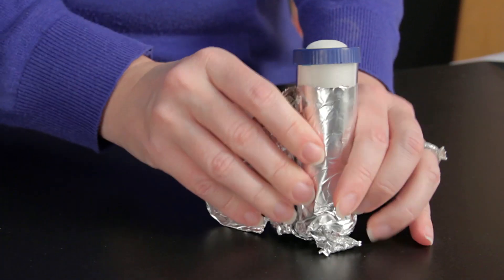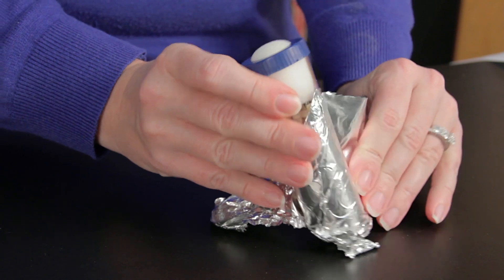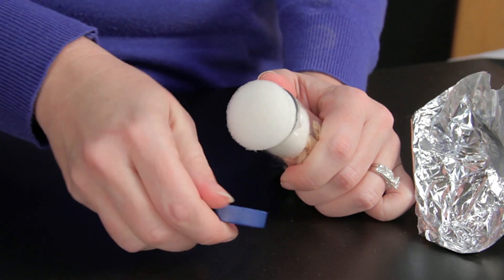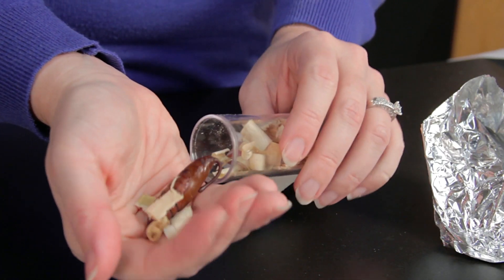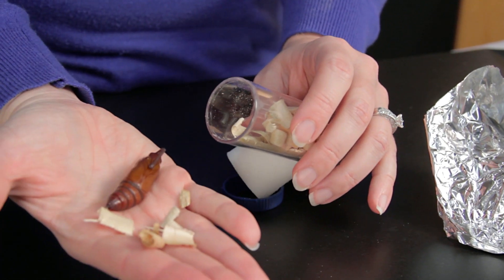After seven days, open the vial and remove the pupa. Place it on a paper towel in the bottom of the Carolina Butterfly Sanctuary. Provide a crumpled paper towel or branch for the moth to climb on when it emerges.